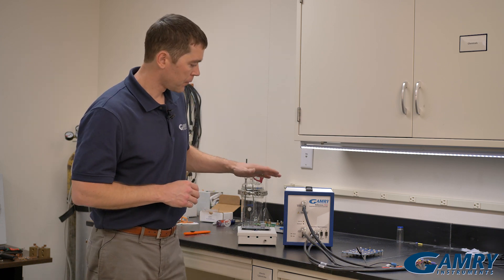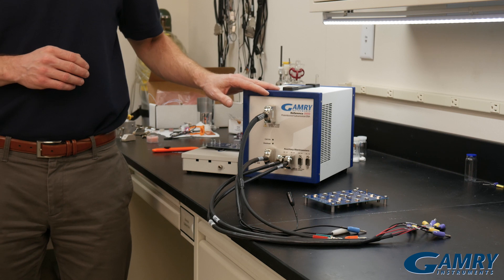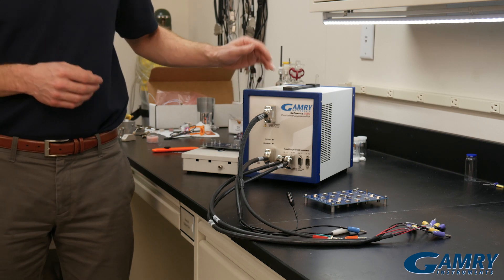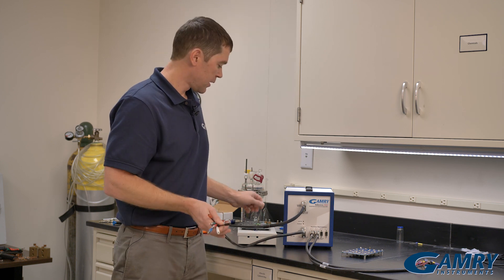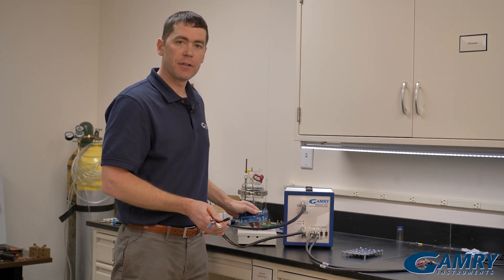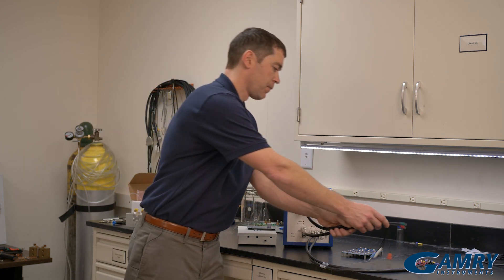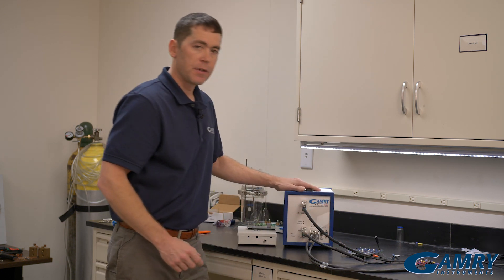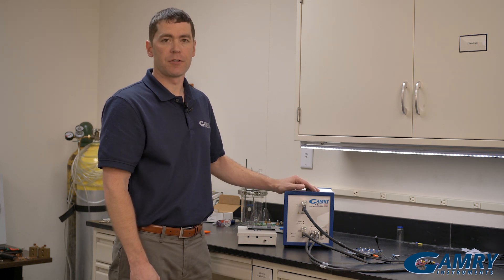Hi, I'm Chris Beasley with GAMRI Instruments, and in this short video I'm going to show you how to calibrate the GAMRI Reference 3000 Auxiliar Electrometer. We already have videos available on how to calibrate a GAMRI Potentiostat, where I explain how you connect your cell leads up to our calibration cell and place it inside the calibration shield. The same still applies when you want to calibrate your GAMRI Reference 3000 Auxiliar Electrometer.